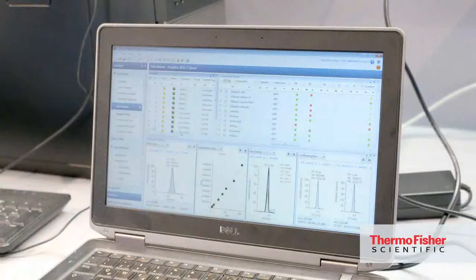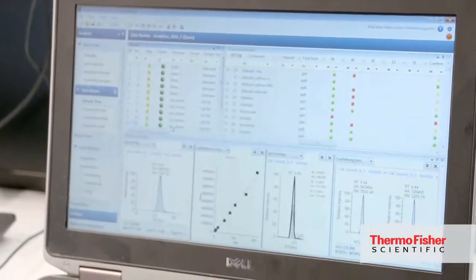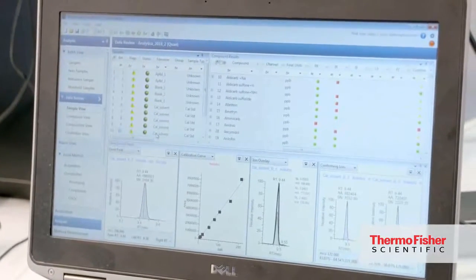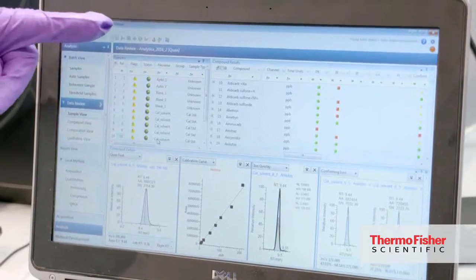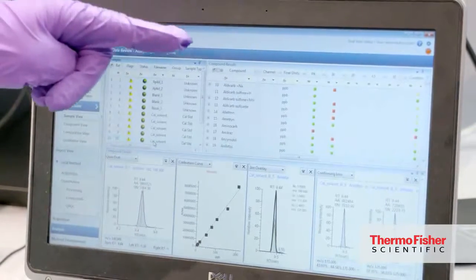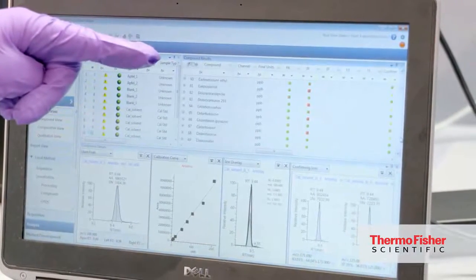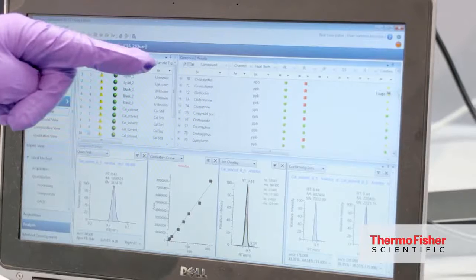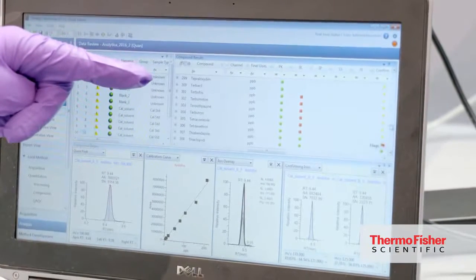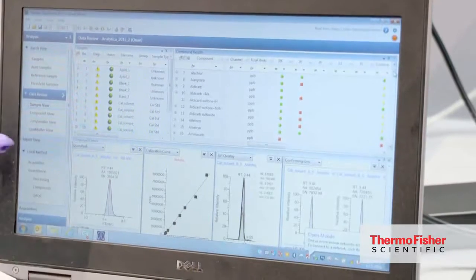Evaluation of the measured sample is done by the high-throughput software TraceFinder. Here is a typical panel of TraceFinder where you can see all of the samples what were measured. You can see all of the compounds which are checked. You see that nearly 300 compounds which are currently analyzed and screened. And also you have the flagging system.